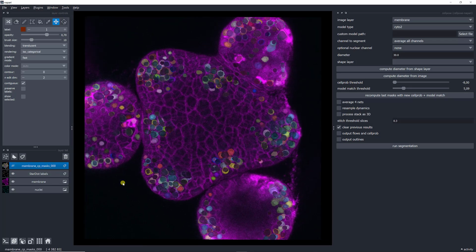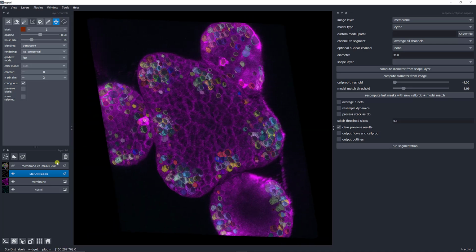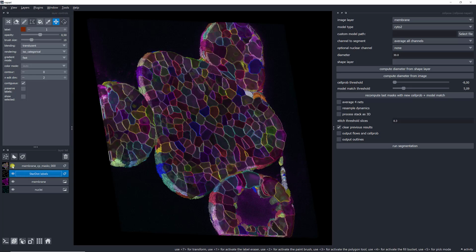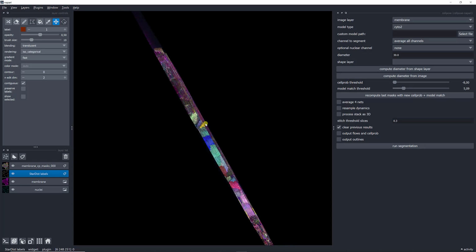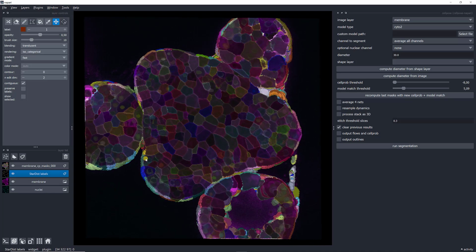So here, yeah, it showed me an error message because we were looking at the contours, and it cannot render the contours, which makes sense. It would be really hard to do. And I can then look at the segmentation of my cells. And so it's fair. It's a fair result, we'll say that.